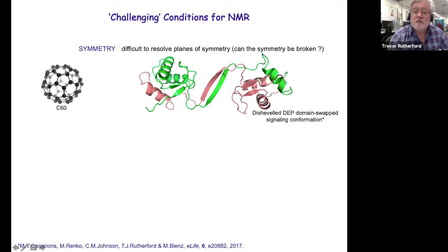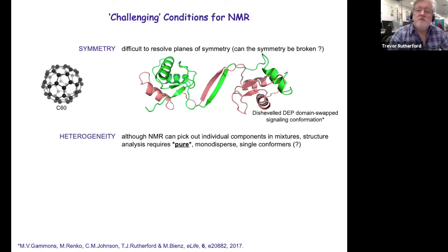homodimer in this context. There is a way in which you could possibly consider having a mixed isotopic labeling strategy where you try to label one of these partners where it's not labeled in the other. So it may be possible to break down the symmetry in some way, but it would be very challenging to identify information from both parts of the homodimer in this case.